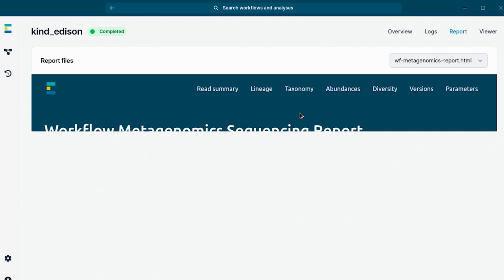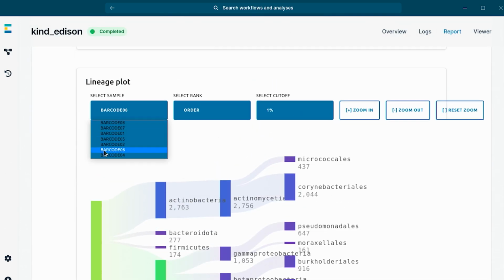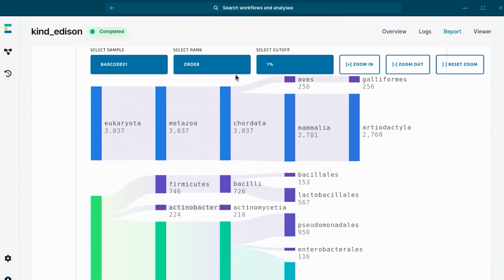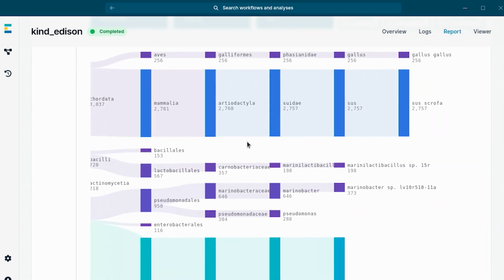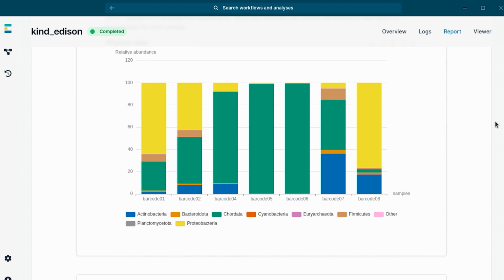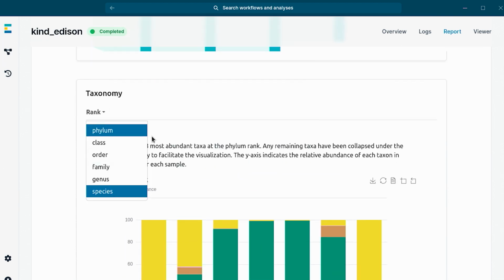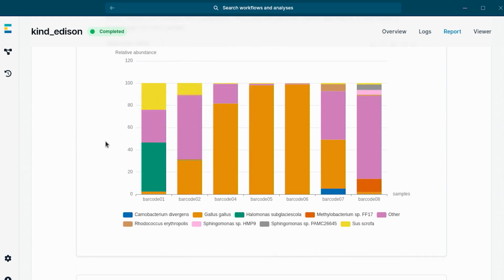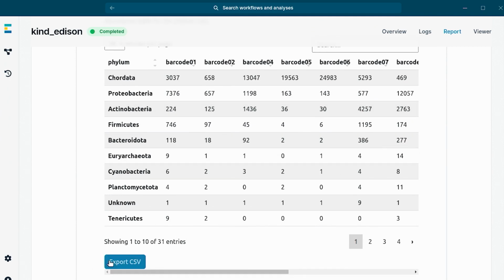And then it's also possible to make some comparisons among samples in the bar plot. So you can see, for instance, to follow a time series, or just comparing between groups of samples if you need it, also to detect if you got some unexpected results. That's it. But as we know that you want to do more complicated analysis, just feel free to export the tables and play with them later.